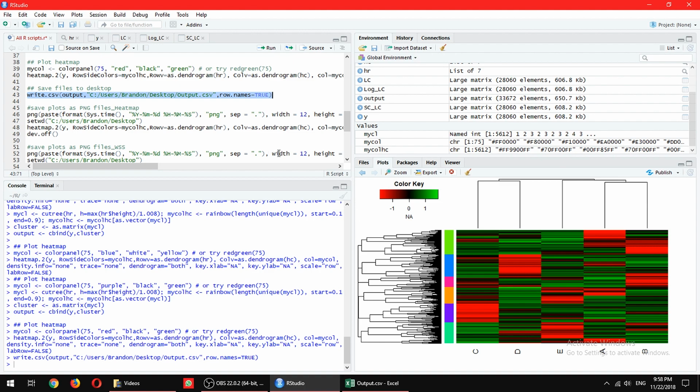Okay, once we are done with the file, let's try to generate some figures. The first figure, of course, is the heat map. In this case, I'm using PNG format because TIFF format is very big. PDF format doesn't allow me the flexibility to manipulate, and it's quite hard to integrate. Let's say I want to put it into a Word file, like I usually prepare my journal articles in. It's very difficult, so I usually use PNG. PNG has a relatively small file size and actually quite a good DPI.